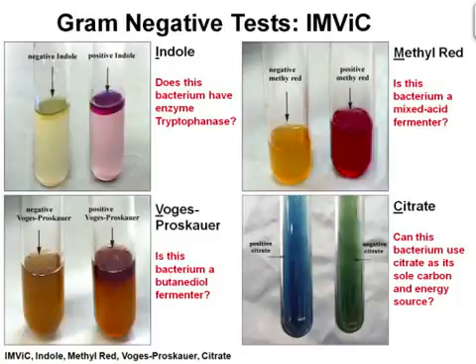A positive result is indicated by a pink-red layer forming on top of the liquid, as shown in the upper left photo. Escherichia coli produces a positive indole test, while members of the Klebsiella, Enterobacter, Hafnia, Serratia group are all mostly negative.